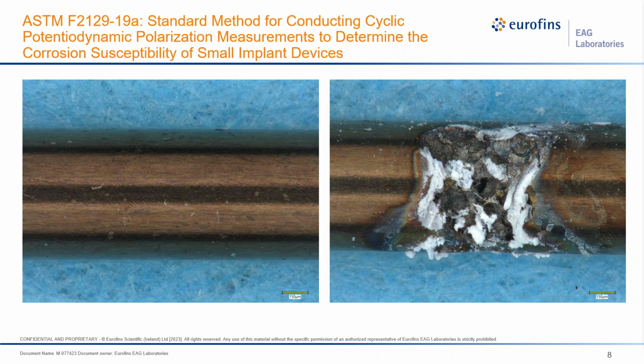Prior to the commencement of each corrosion test, the medical device is imaged using a Keyence VHX-7000 with magnifications up to 200x. The goal of the digital images is to capture an overall picture and specific areas that are more susceptible to corrosion damage prior to corrosion testing, and compare them with the same digital images after corrosion testing.